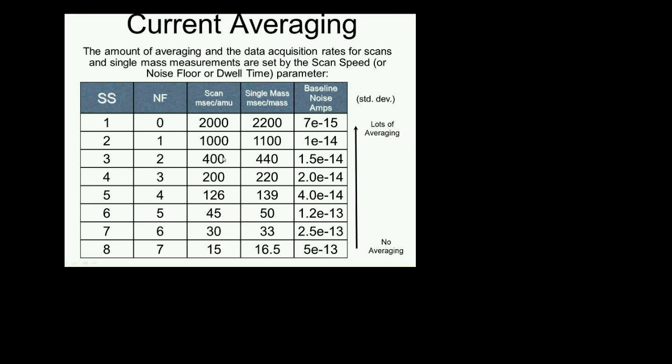In that case, it takes 400 milliseconds per AMU to perform a scan.